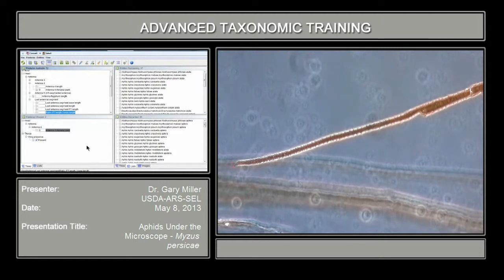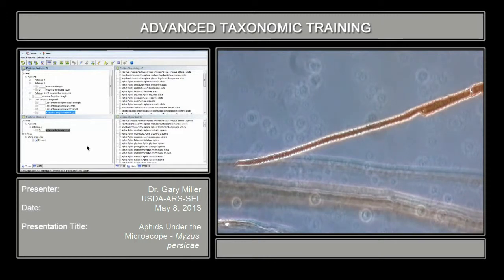I've keyed out specimens already where, lo and behold, the terminal process was broken off and it throws off measurements. So you want to make sure that you see those two CD there.